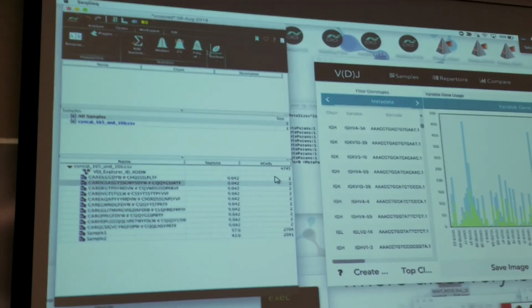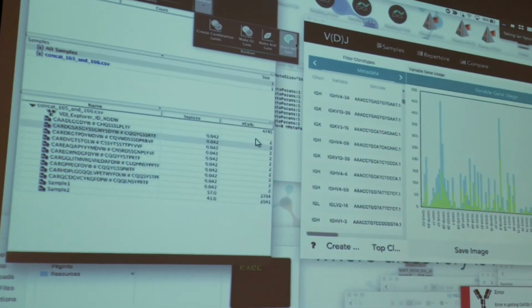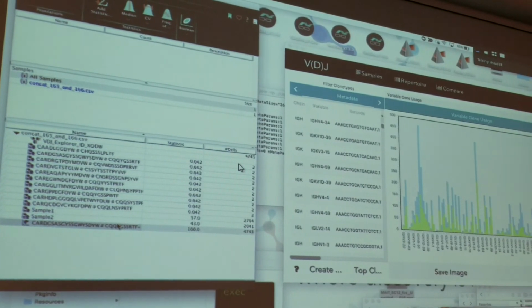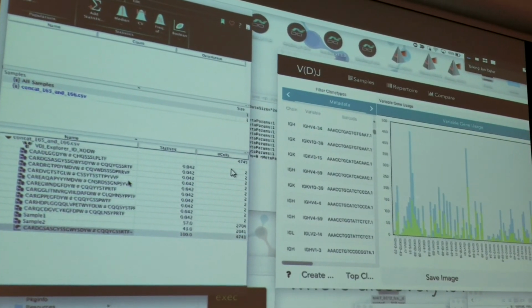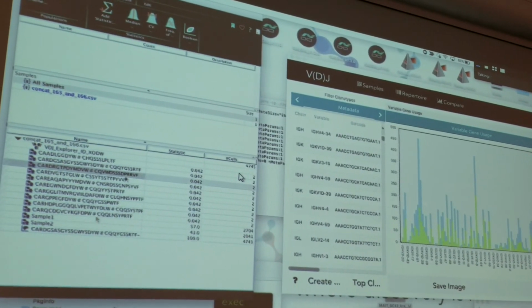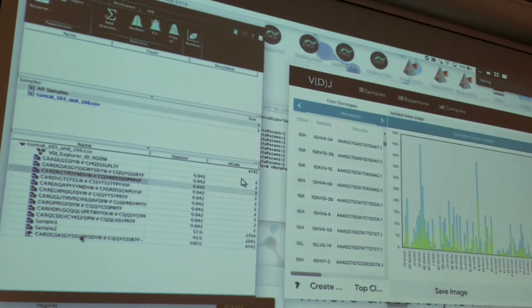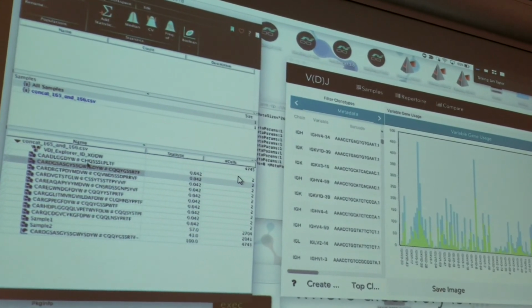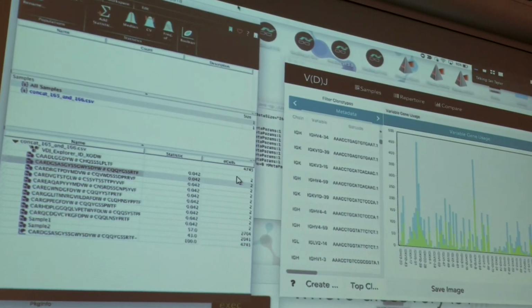To do that, I would start with creating a Boolean not. The reason you do that is to have something to compare against, right? Yeah. Well, we keep comparing those two cells, which, remind me again, it's this sample. No, that's the wrong one, sorry. This sample versus, or this population, two cells versus these cells.